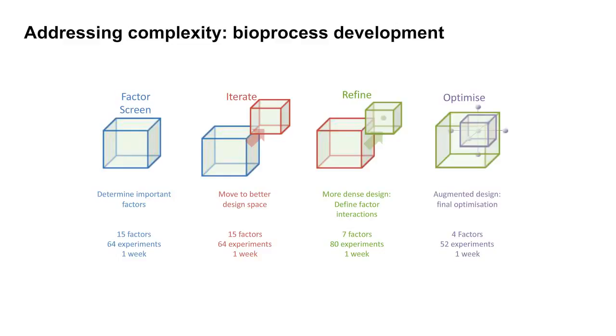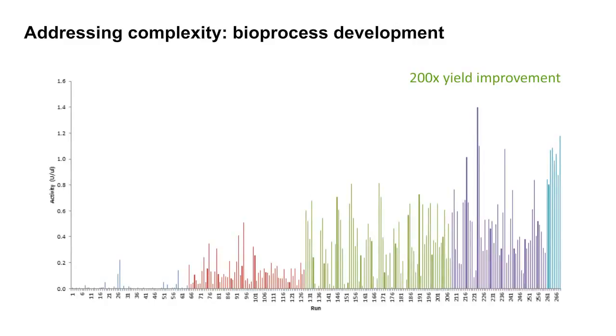To be clear, this is fundamentally sitting atop building a model of what might be occurring in the biological system, determining what observations are going to tell us the most information, then using Antha to physically do the experiment, collect the results with biology telling us what's going on, and ultimately using that to refine our model. So in terms of actual data, it's not a huge number of experiments that are required to do this sort of iterative investigation into biology, but the complexity of every single observation is extremely high.